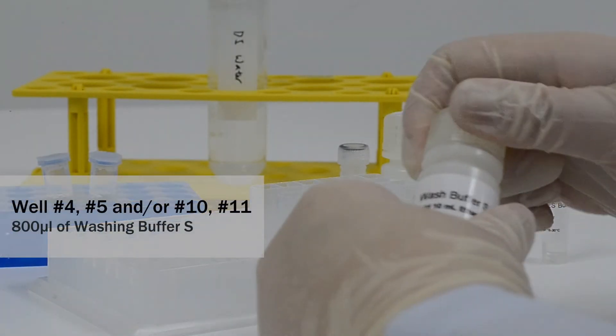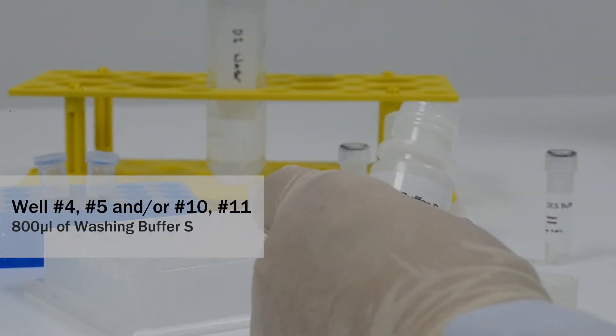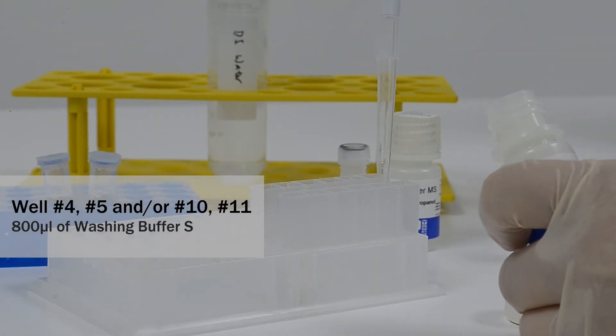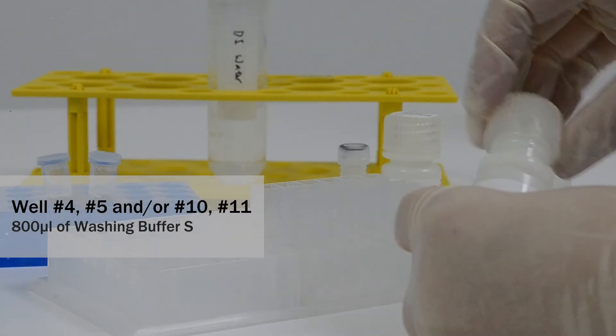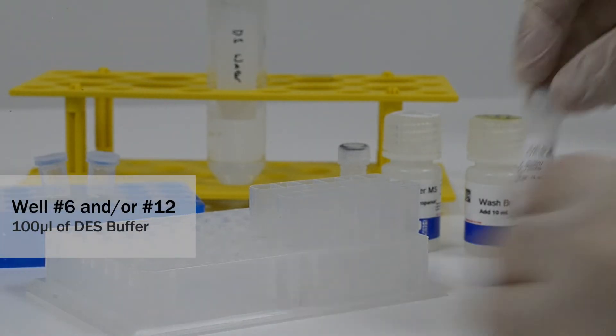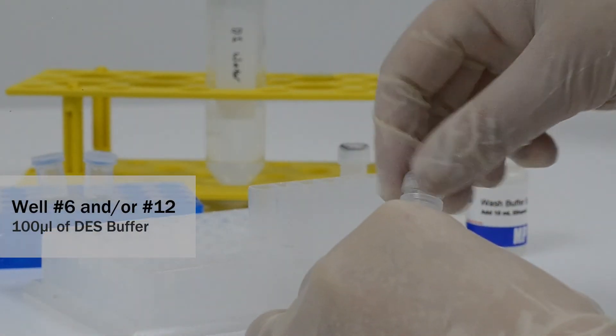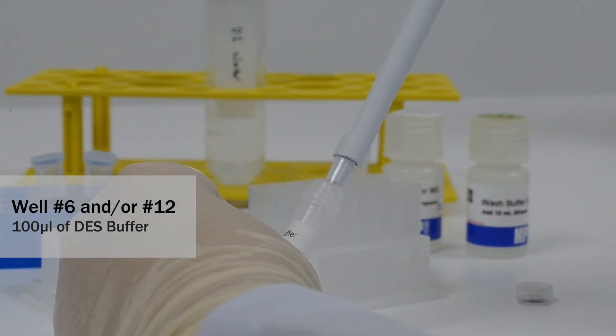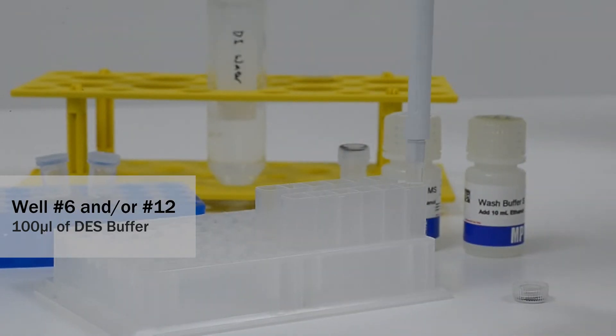Add 800 microliters of wash buffer S into the fourth and fifth wells. When using 96 deep well plates, you can allocate it in the fourth, fifth, tenth and eleventh well or column. Add 100 microliters of DES buffer into the sixth well. When using 96 deep well plates, you can allocate it in the sixth and twelfth well.